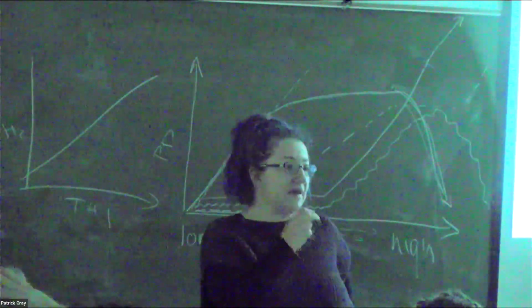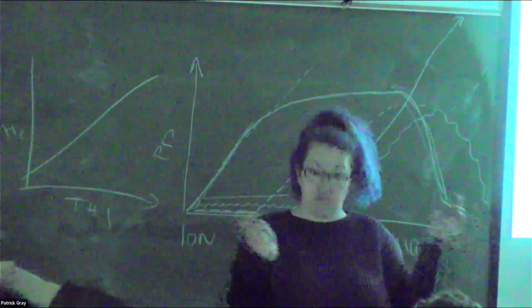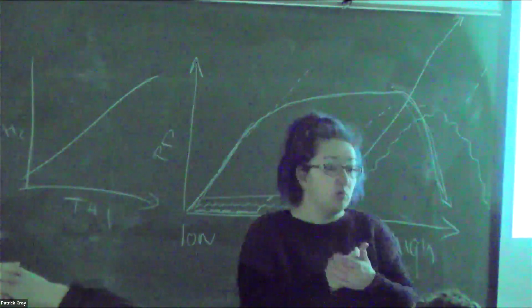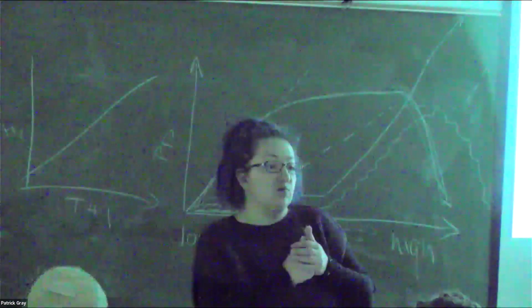And so, one group activity, you have done it already. You have to filter the samples. Split into 3 groups. Each of you has a culture; babysit the culture and do exactly as you're told. You're gonna go and make a serial dilution, and then the little dance starts. And we're gonna make it happen, okay? When we put the filter on that filter rack, we go filter, okay? Discussion about a group activity after this.